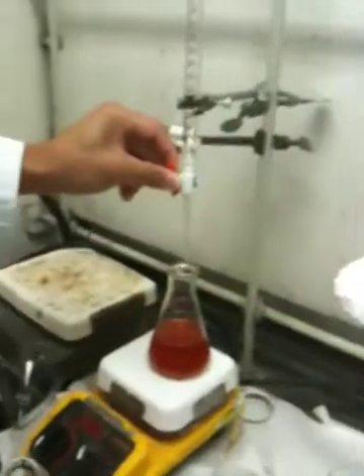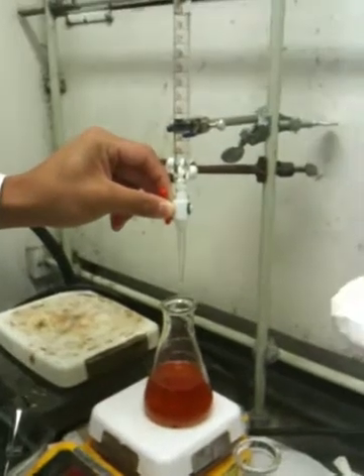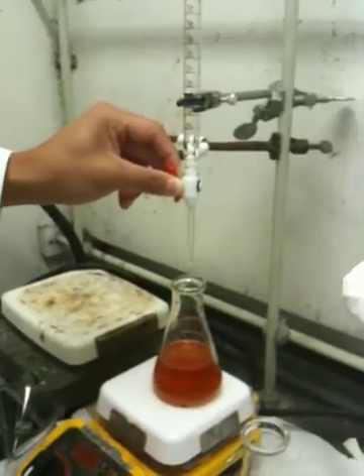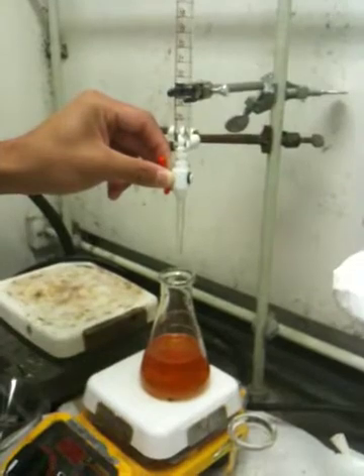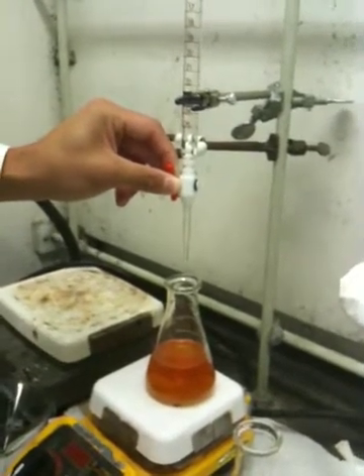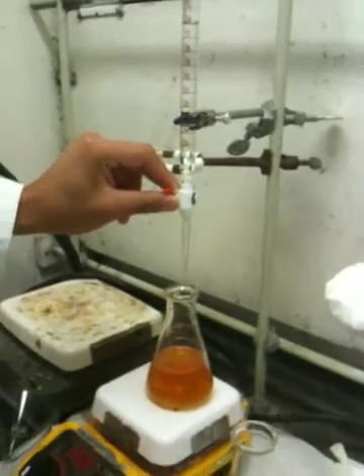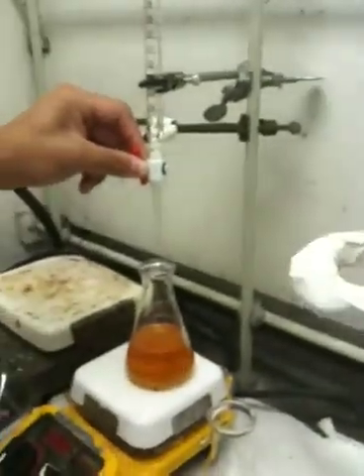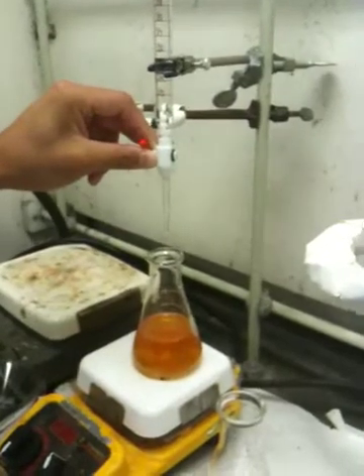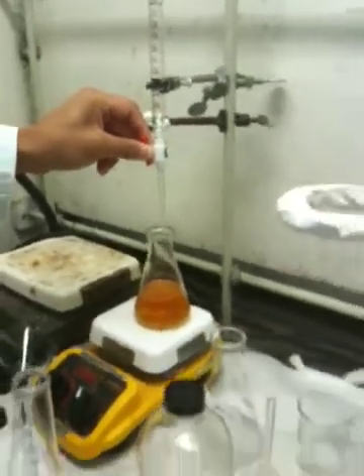He's titrating some Na2S2O3 into an Erlenmeyer flask which has 0.1 grams of vitamin C crushed, 15 mils of water, 10 mils of... H2SO4 — sulfuric acid. And it has 1 gram of potassium iodide, and then another 0.1 gram of sodium bicarb.